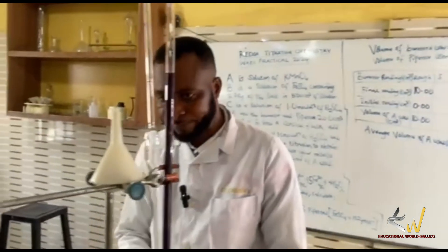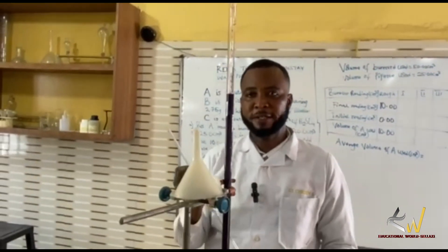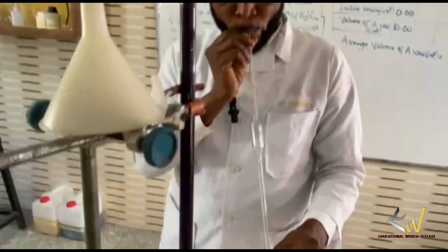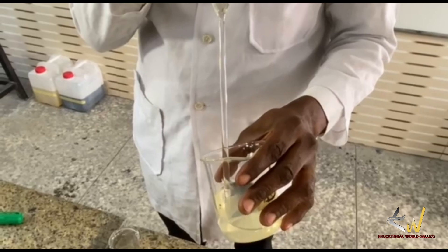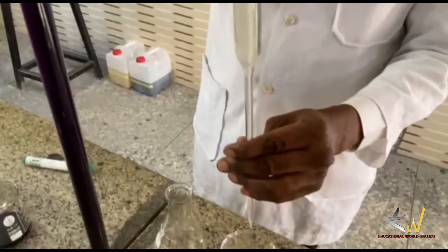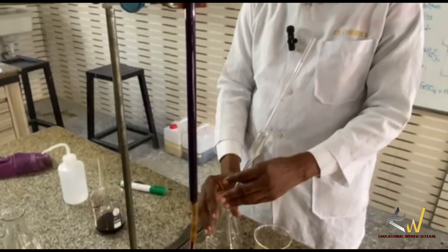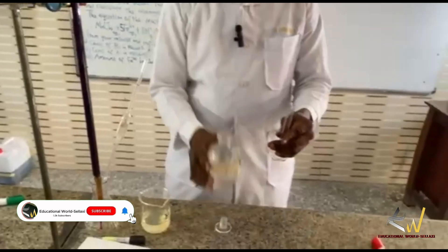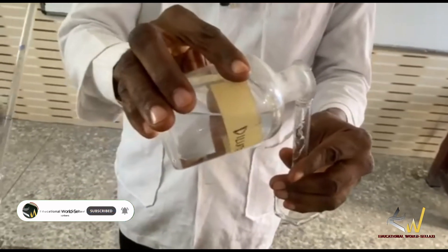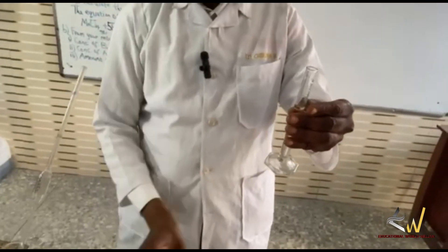So my first reading — I prepared another set. I'm starting with 10 because my burette capacity is actually 50 mL. That should be on your eye level. While that is settling, I carefully measure my 10 mL of dilute solution. It has to be 10 mL each titration. All right, that is my 10 mL.